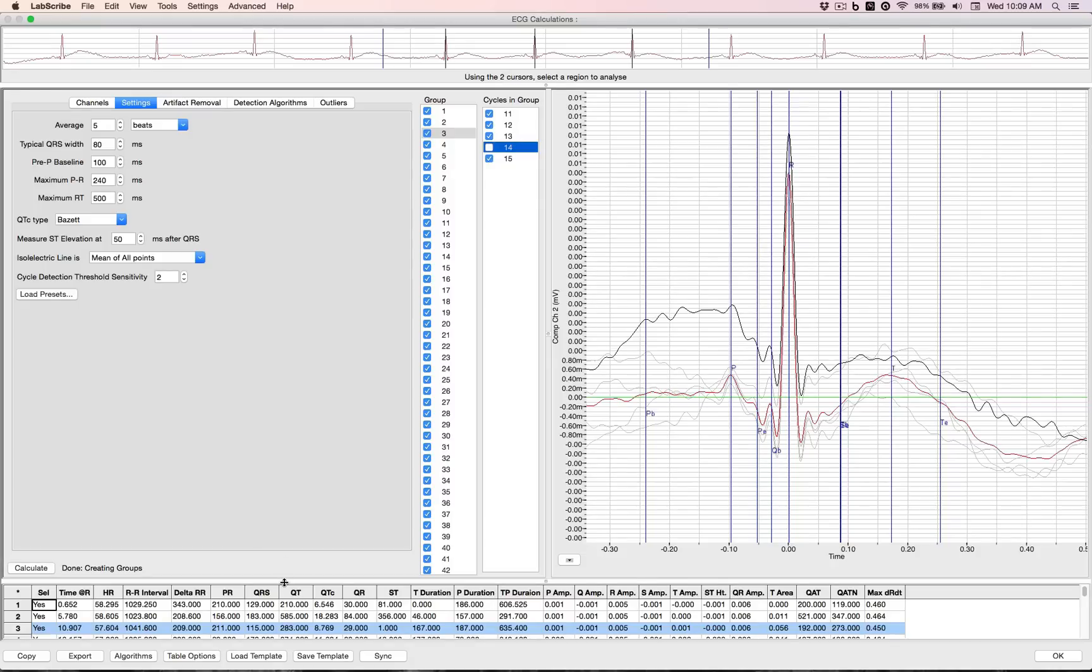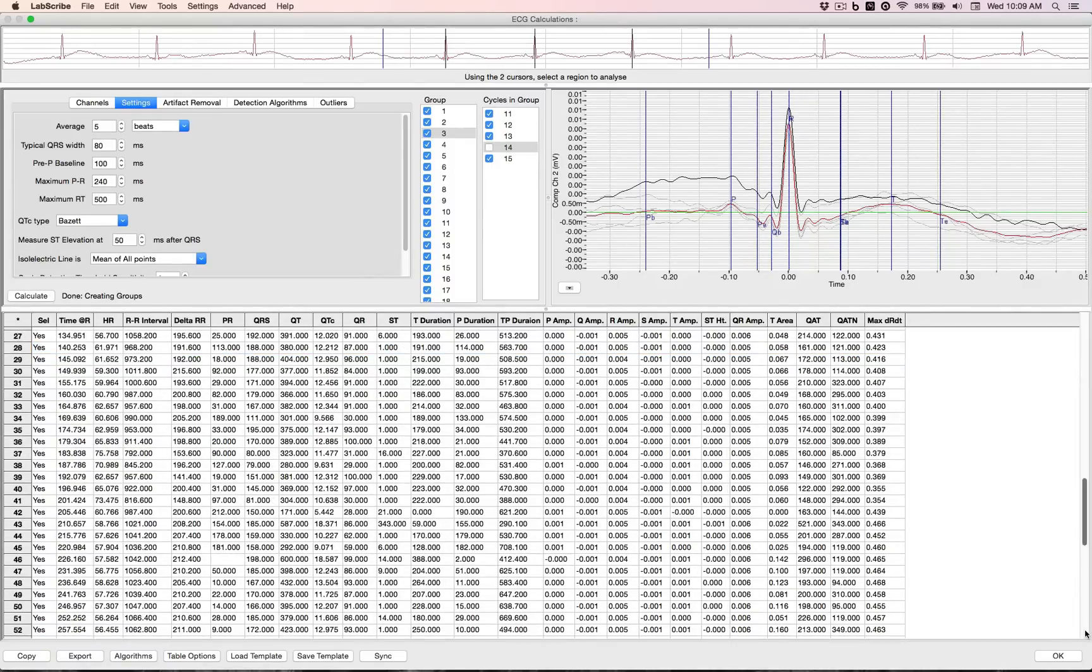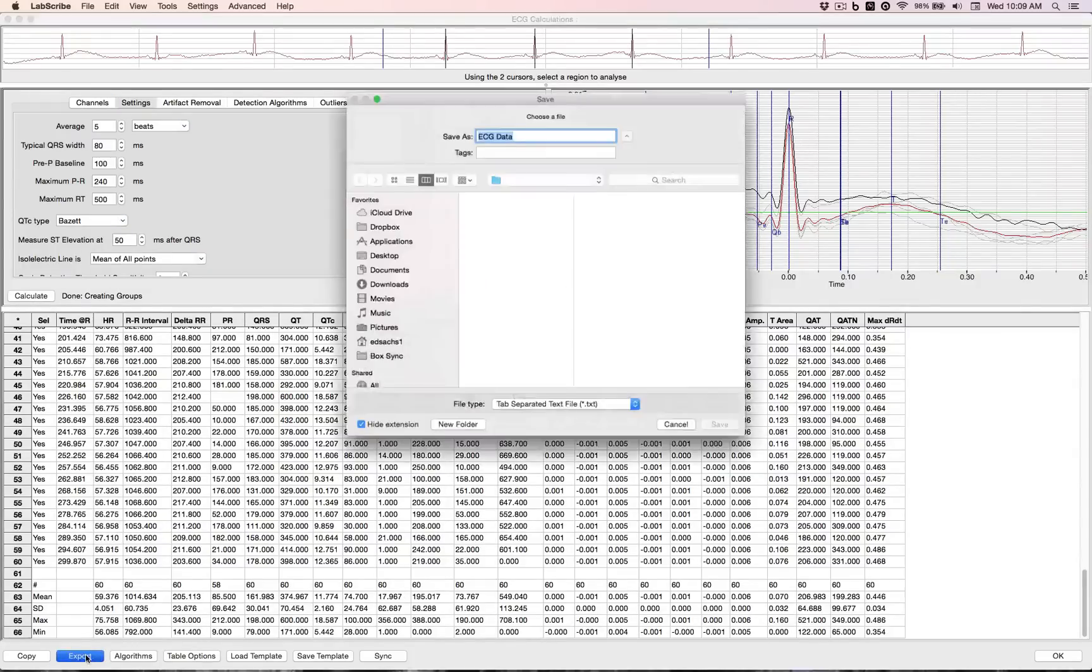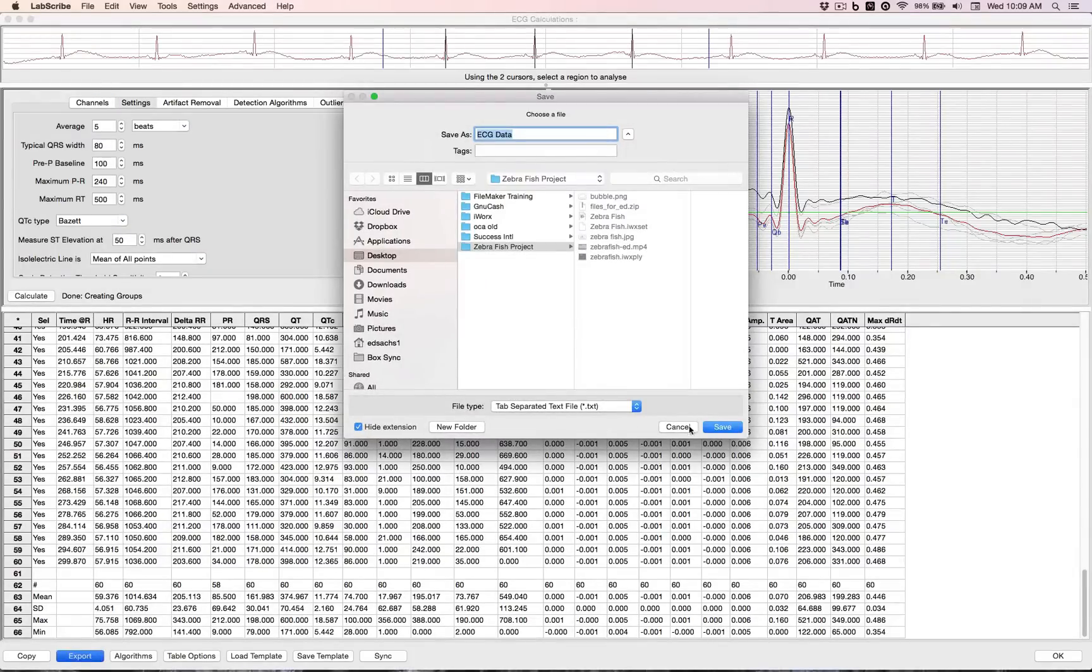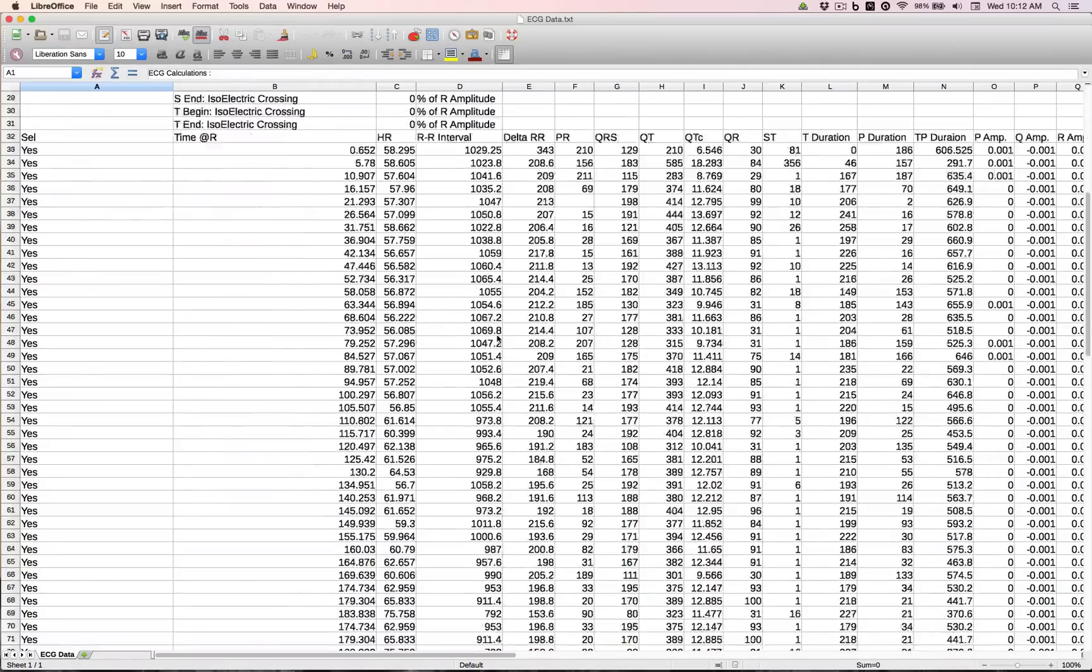Once all that is done, we can see our data on the bottom. And once we're happy with that, we can then export it out. And then open it up in our favorite spreadsheet.